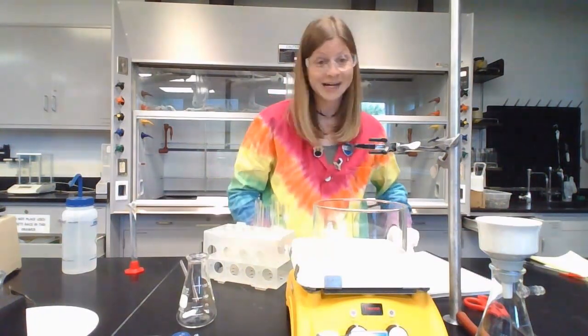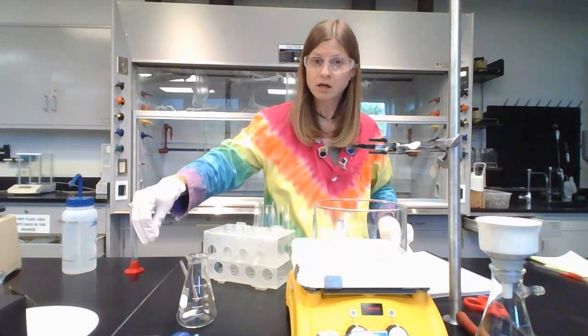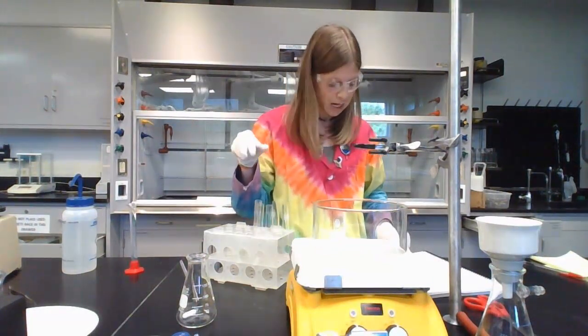And then you're going to put it in an ice bath. So do not go directly from warm water bath to ice bath. That's a dramatic temperature change. Things can break. Plus, you won't get as good of results. So it needs to slowly cool first before it goes into the ice bath. And it says squiggly line 2 minutes. So it's only going to be in the ice bath for about 2 minutes.